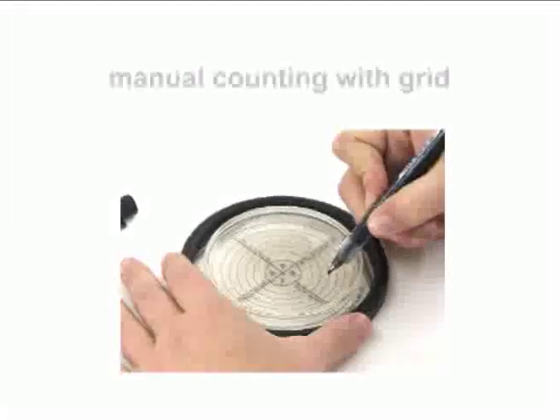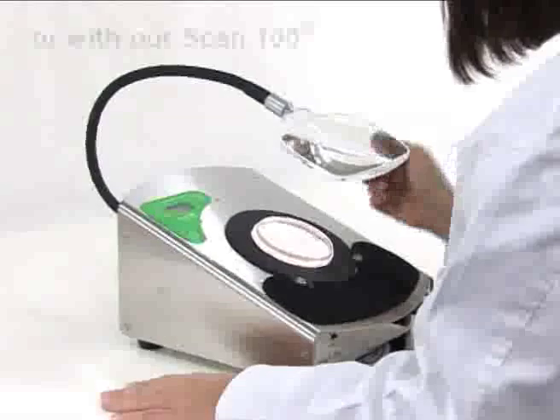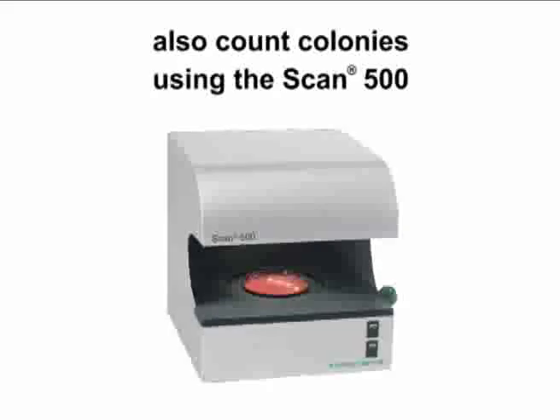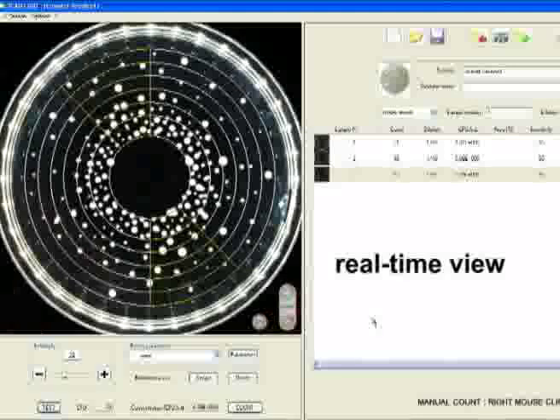Counting is easy. You can count the colonies by hand, but you can also use the InterScience Scan 100 or the InterScience Automatic Scan Colony Counter, which guarantees an instant and automatic colony counting of both spiral and traditional plates.